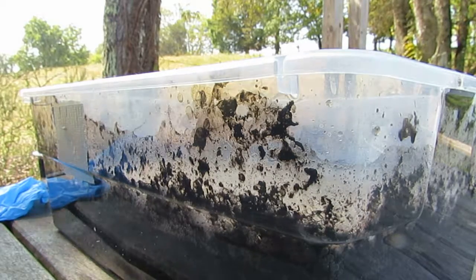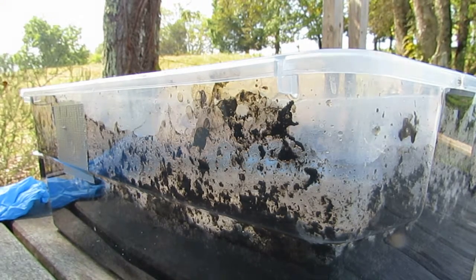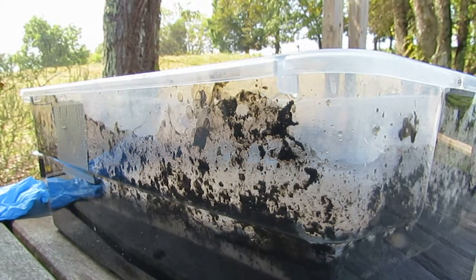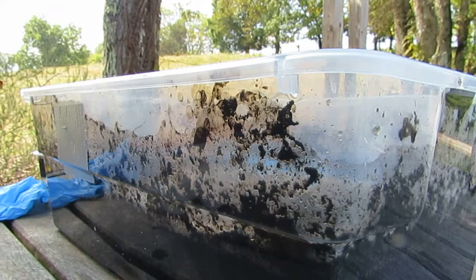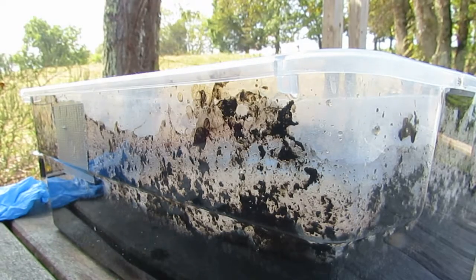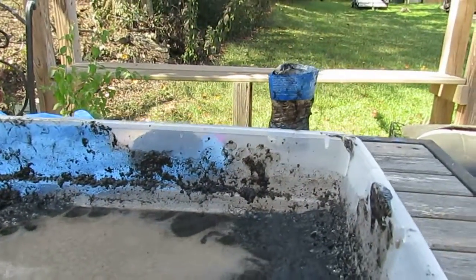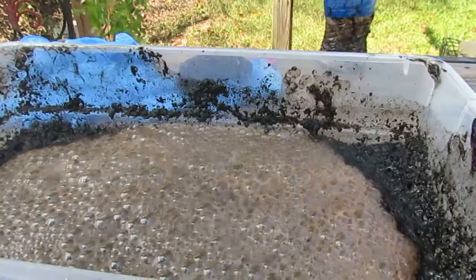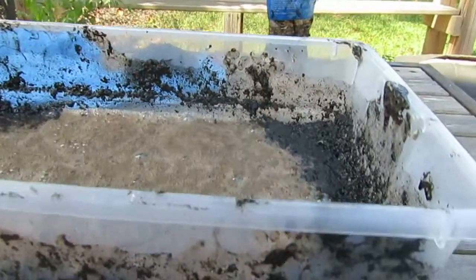That stuff is stuck down there now. That should be enough. I don't know if the camera will pick it up, but there's some vapor right here. I don't know if it's going to pick up the bubbles of gas, because there is actually visible carbon dioxide.